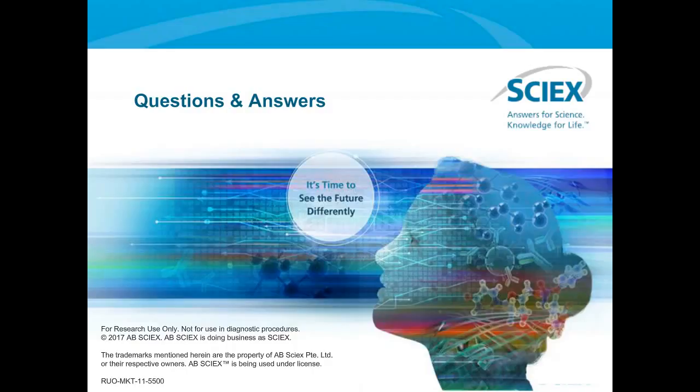Do you need to analyze purified samples, and what is the lower limit of protein that can be analyzed? It's the same answer as I had before. It really depends on the glycosylation extent of the glycoprotein itself. If it's very heavily glycosylated, it's even in the sub-microgram range. If it's very, very lightly glycosylated, it has to start from a couple of dozen micrograms. Again, it's sample dependent. There is no straight answer for that.